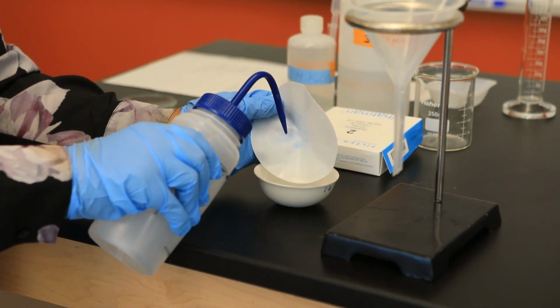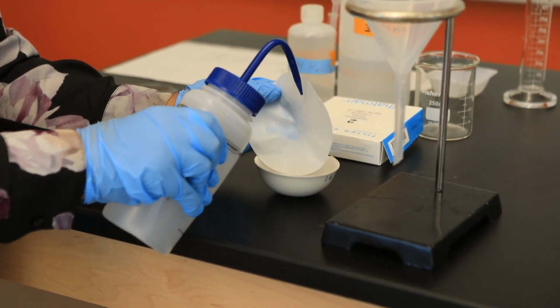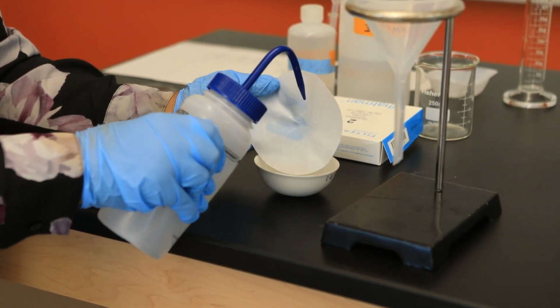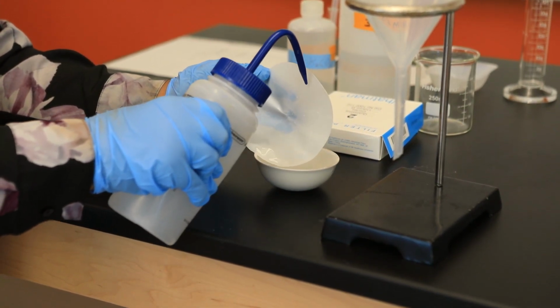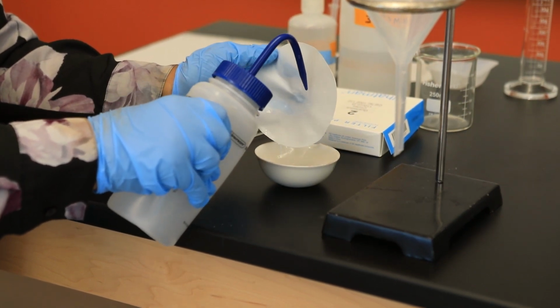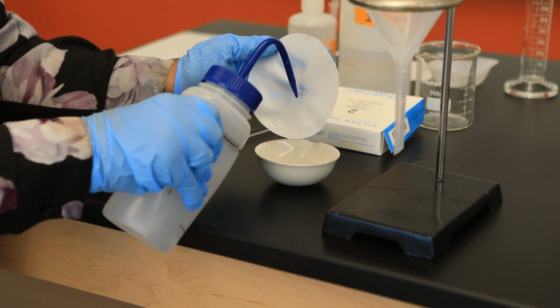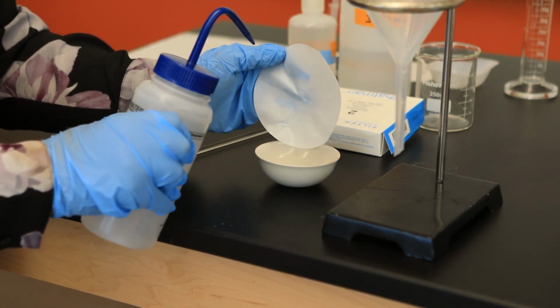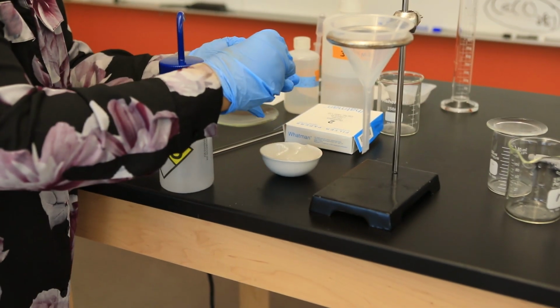You can still see a small amount of the calcium carbonate, but I'm using the water in my wash bottle to remove all of the solid. Beautiful. Once that is done, I can go ahead and discard my paper. I will not need this paper moving forward.